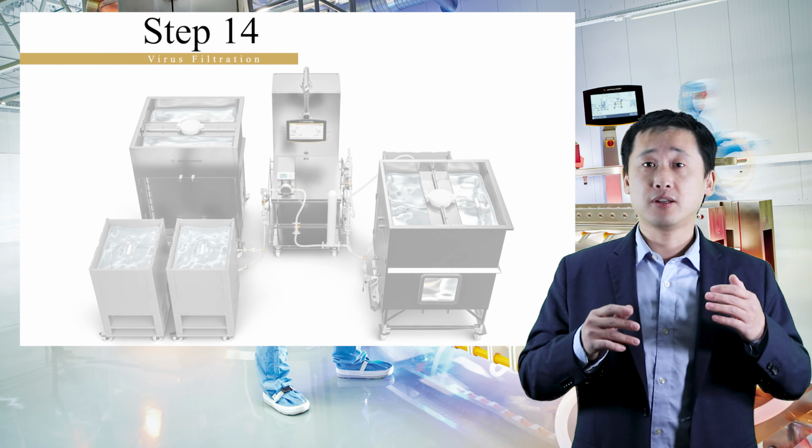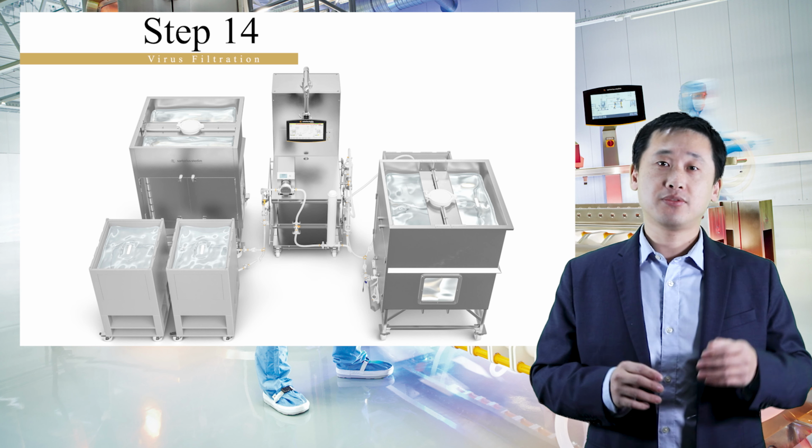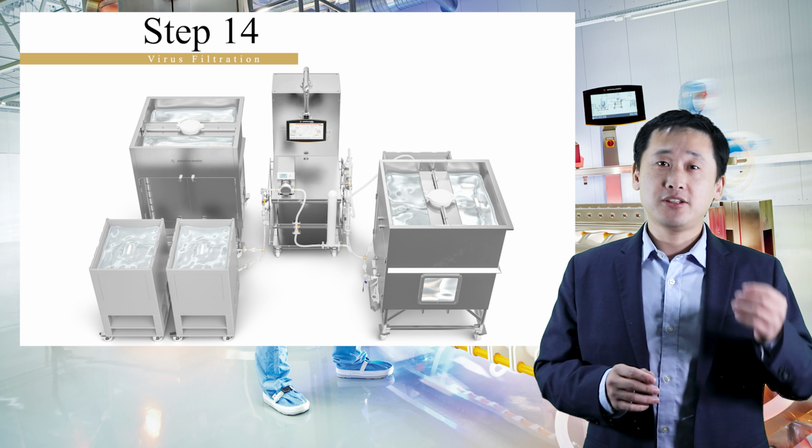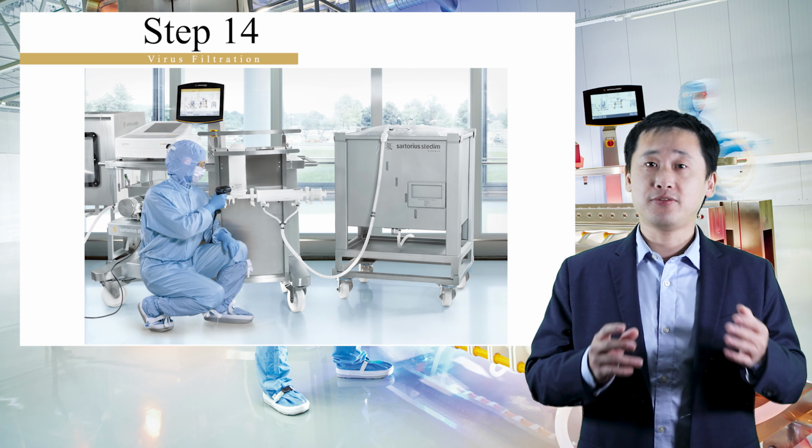Next is the virus filtration. After 3 polishing steps, you have the virus filtration. Now, this step removes a broad range of viruses depending on the pore size of the filter.